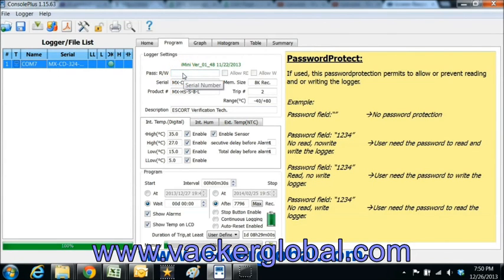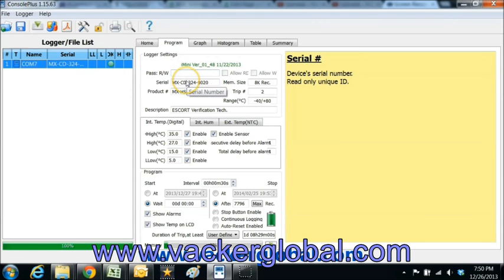In the upper portion, you can see the general details of the device such as serial number, model number, memory capacity, etc.